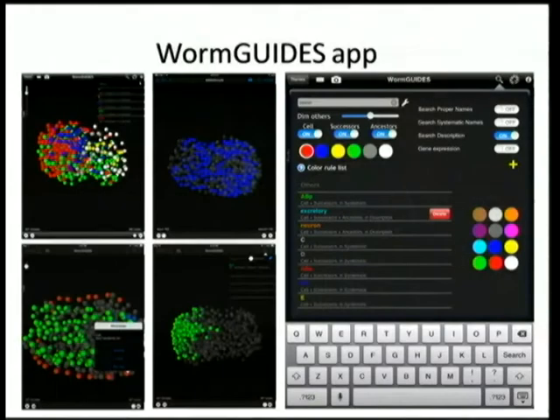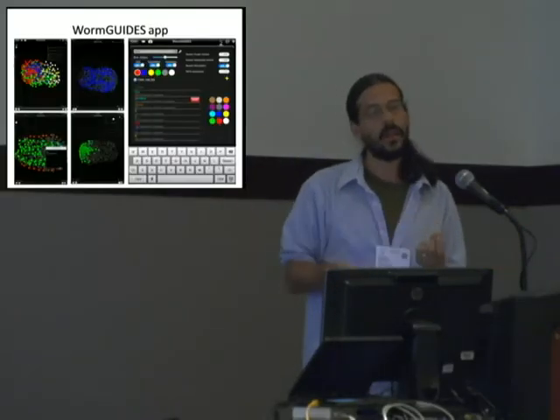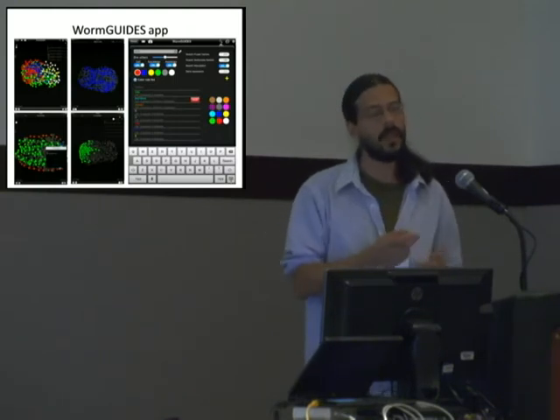The next step, in the next couple of months, is to actually start to superimpose a little bit of neural morphology data on top of this, from a couple of data sets that we were starting to generate using a more or less manual pipeline. And I think we're going to learn a lot when we start to do that about some of the visualization issues of trying to navigate. Even the nuclei are complicated enough once you start to layer in a bunch of colors, but to navigate the much more complicated display when you start to put in detailed morphology and look at how the shapes of multiple nearby cells are interacting with each other.